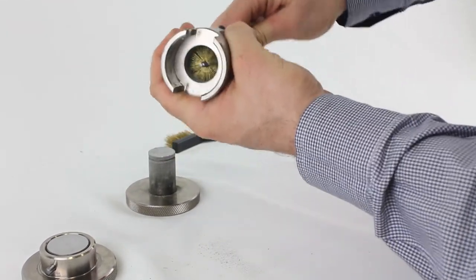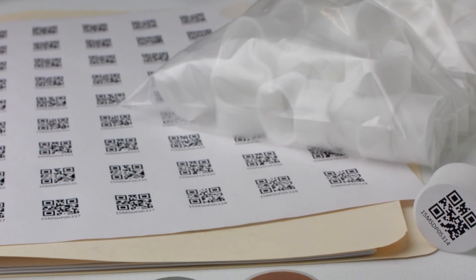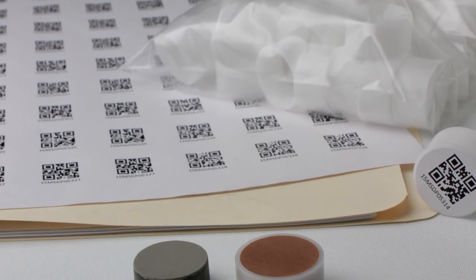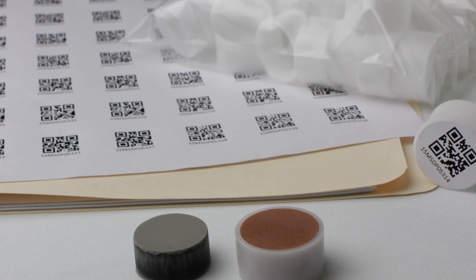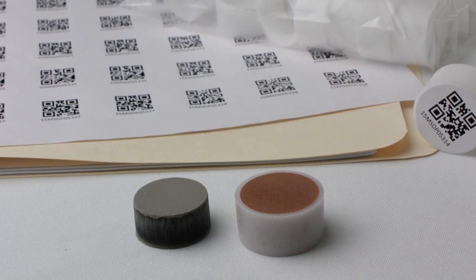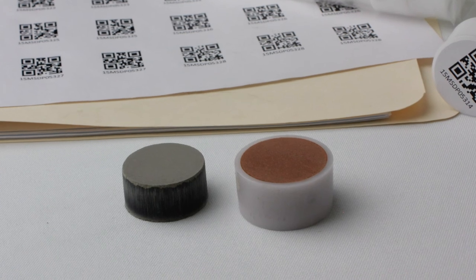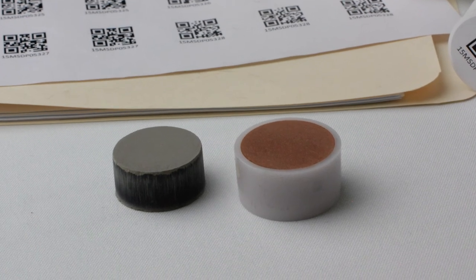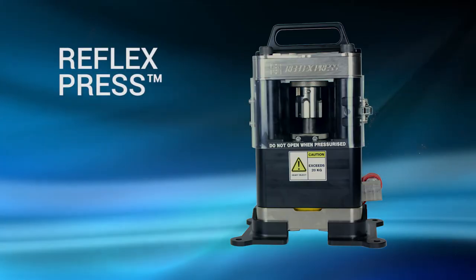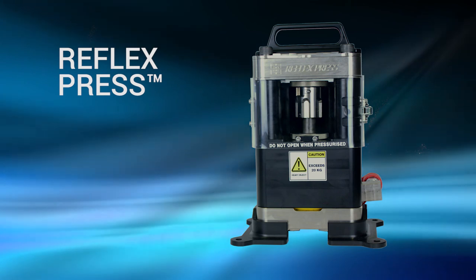The denser, flatter, and more uniform puck provides a more reliable surface from which to gain a quality analysis. With no film required between the XRF analyzer and the sample, the risk of a weaker or poor signal is eliminated. The same puck can also be used with other non-destructive testing techniques such as spectral analysis and LIBS. The Reflex Press: delivering better data at lower cost with increased productivity.